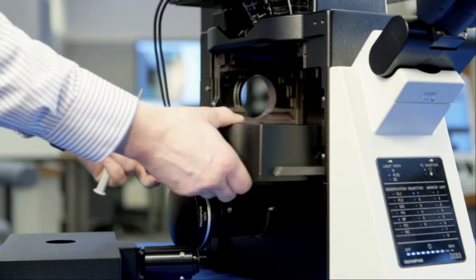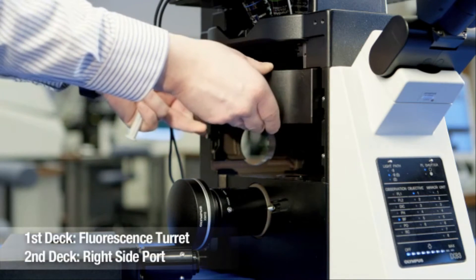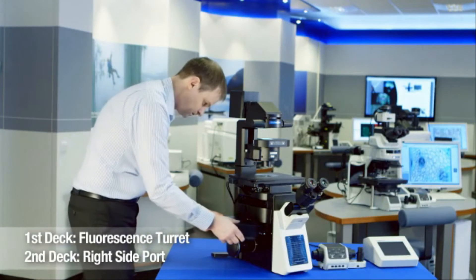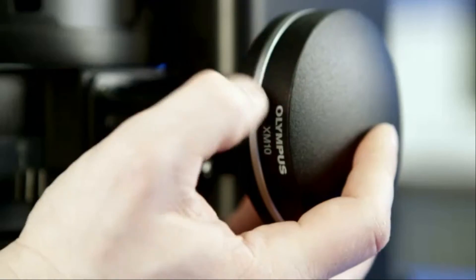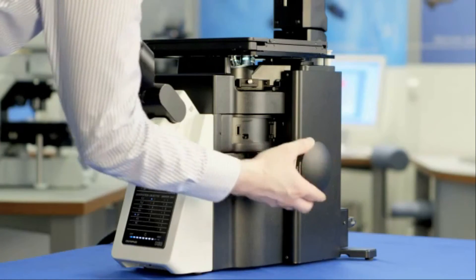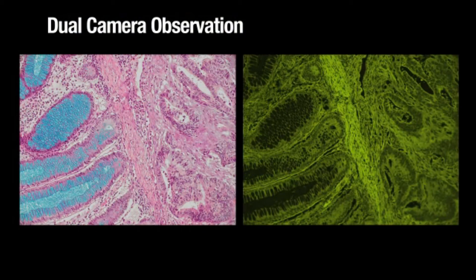Building upon these setups, the Olympus IX3 system can be easily adapted for dual camera use. The filter turret can be combined with an additional camera via the right side port module with a C-mount. This is ideally suited to the analysis of pathology sections, which exhibit different features when visualized with color or fluorescence. An example of dual camera use can be seen with this colon carcinoma section, imaged using both a color camera and a monochrome camera.